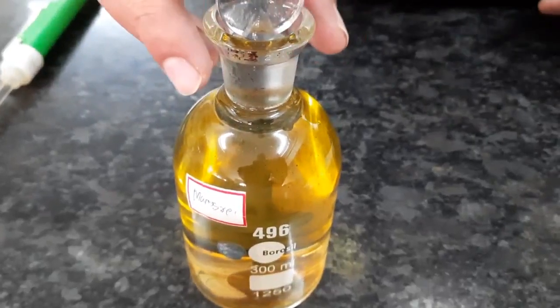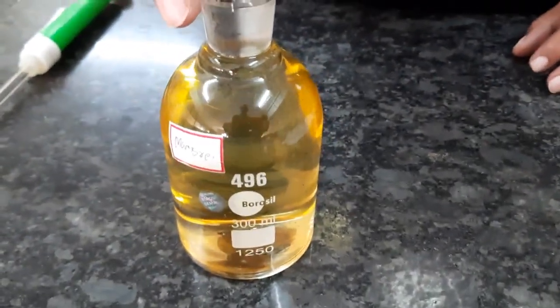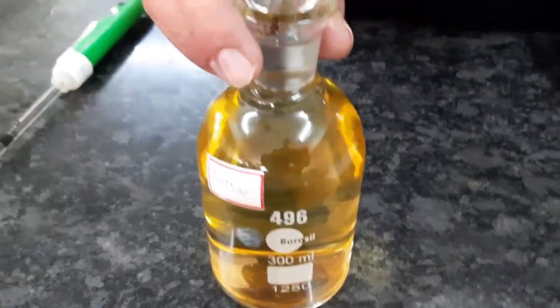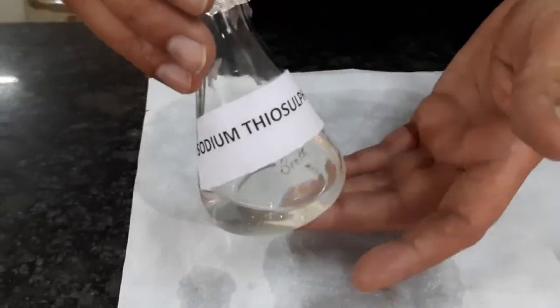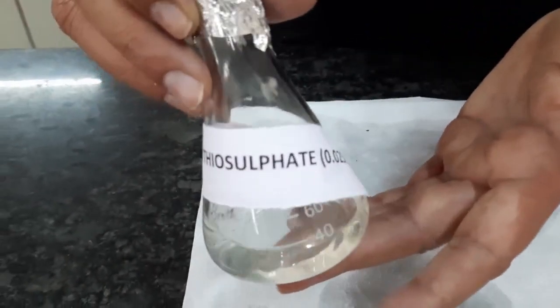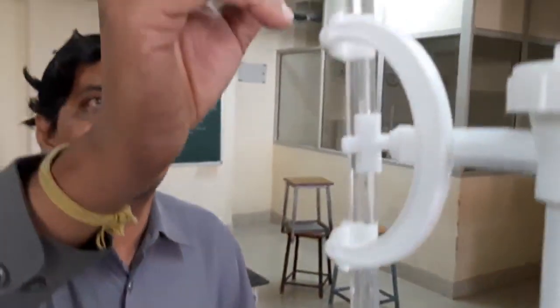Now the water sample after adding concentrated H2SO4 has attained a clear solution. So this can go in for the titration. For the titration we will be using sodium thiosulfate as the titrant, and you can see the normality of the sodium thiosulfate here, and this has to be added to the burette.